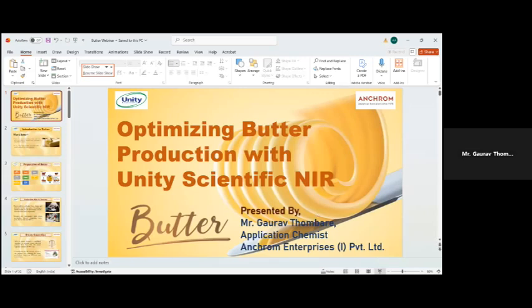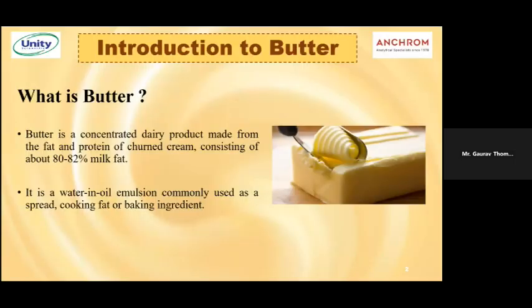So talk about our star of the day, butter. Let us understand what butter is, why we need to analyze butter, and how butter is overall evaluated for its quality. And most importantly, we'll see how this technique would turn out to be helpful to the industry, because industries are the max producers of substances like butter.